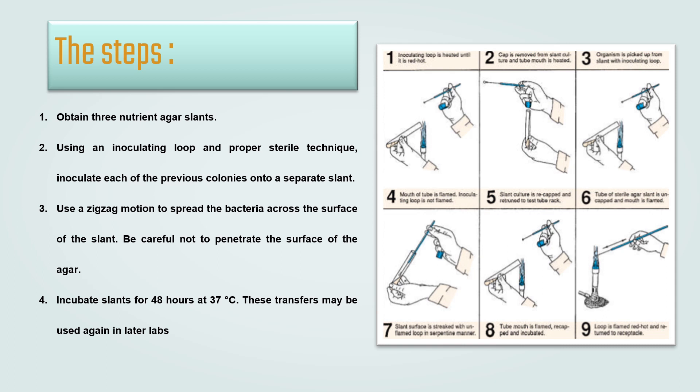Step 6: the tube of sterile agar slant is uncapped and the mouth is flamed. Step 7: the slant surface is streaked with the un-flamed loop in a serpentine manner. Step 8: the tube mouth is flamed, re-capped, and incubated. Lastly, the loop is flamed red hot and returned to the receptacle.